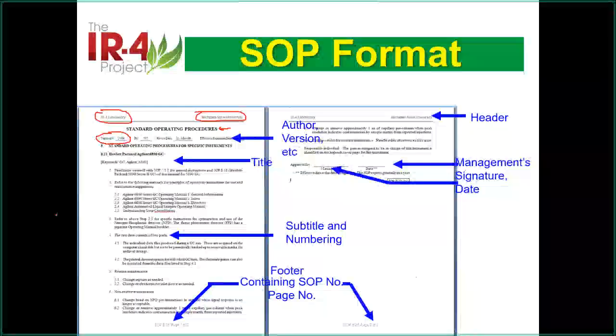Okay, another question: from last year to this year, it's easy, from 2019 to 2020. That's good. How about if I have multiple SOPs in this year? I make some changes now. Then the easiest way, we put a letter after that.